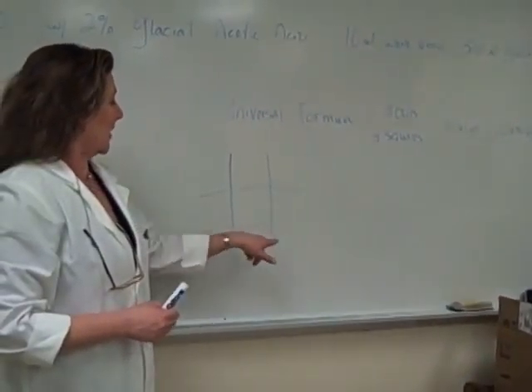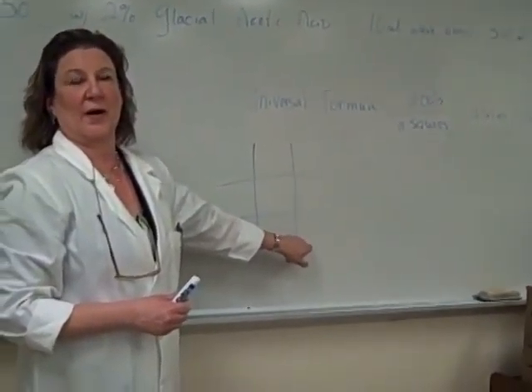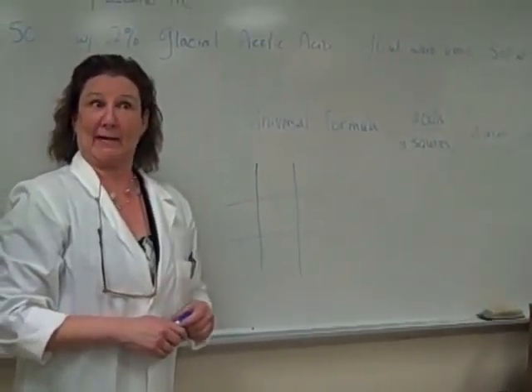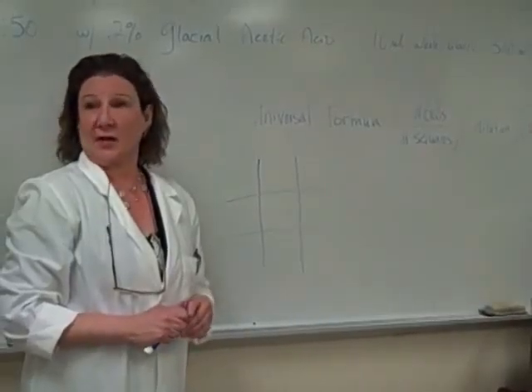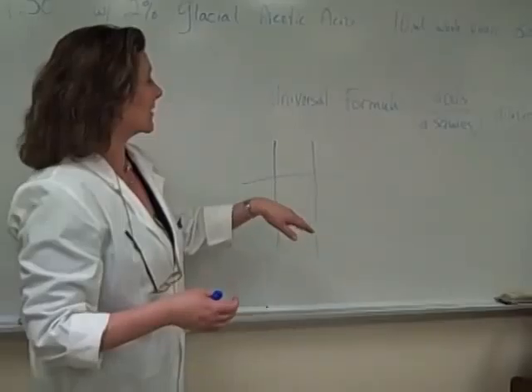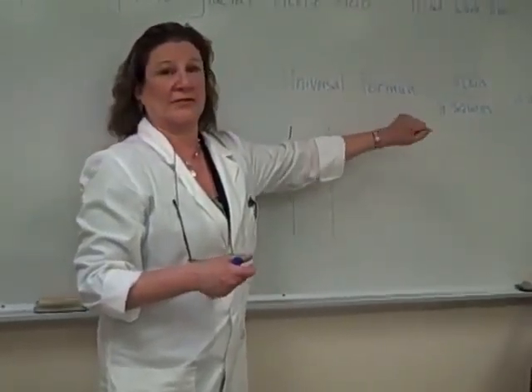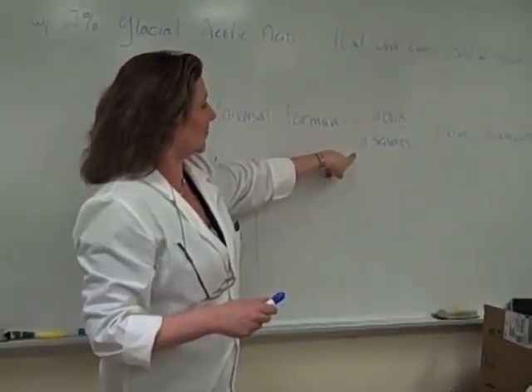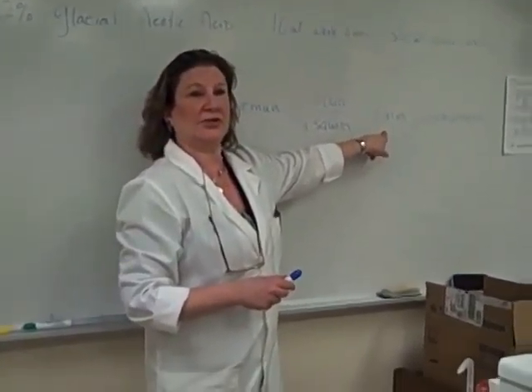If I get to 100, say, in this square, do I have to finish counting the whole entire square? Yeah, you have to finish counting the whole entire square, okay? So you can't just stop at 100, because you need to factor in the number of squares. So we've got the number of cells divided by the number of squares times our dilution factor.